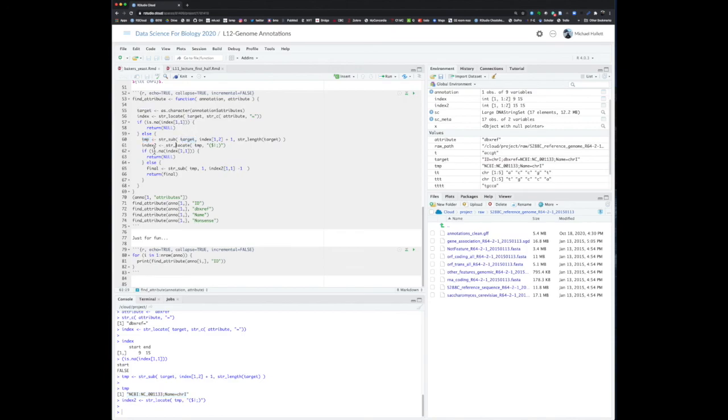Index 2 is run on TMP, and I look for a semicolon or $, and this is a regular expression. And this means I look for the first time that I find a semicolon, and that bar means or the end of line. $ means end of line. So when I run that, I see that index 2 is right at the end of that sequence, right?